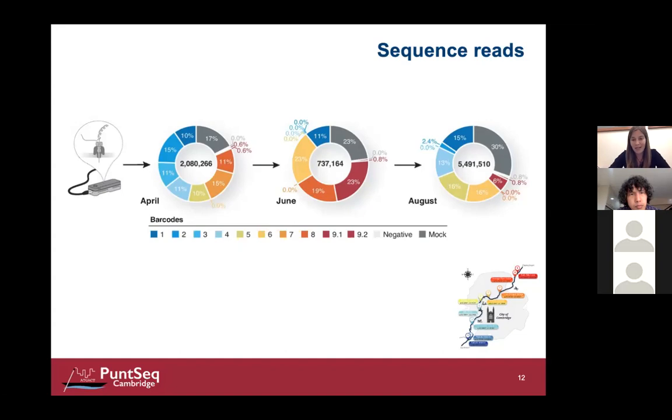Firstly, luckily, we didn't find nearly any reads in the negative controls, meaning that we didn't have any contamination, neither in the lab due to our handling, nor due to any kits that we would use, because these DNA extraction kits and library prep kits actually use bacterial content. So controlling for contamination is, especially for bacterial analysis, very, very important.